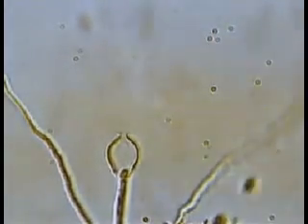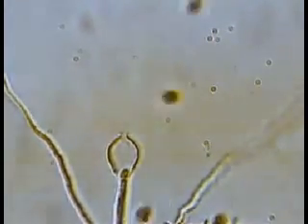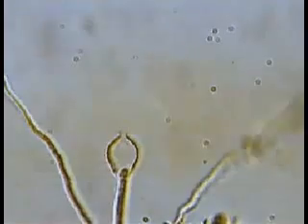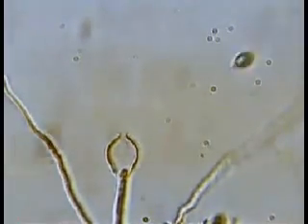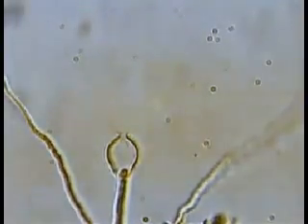Pythium. The big difference between Pythium and Phytophthora is that Phytophthora releases the zoospores directly from the sporangium, and it doesn't form a vesicle outside the sporangium.